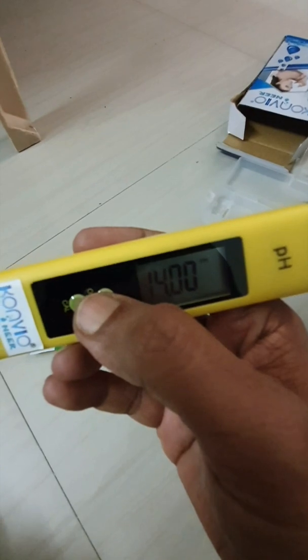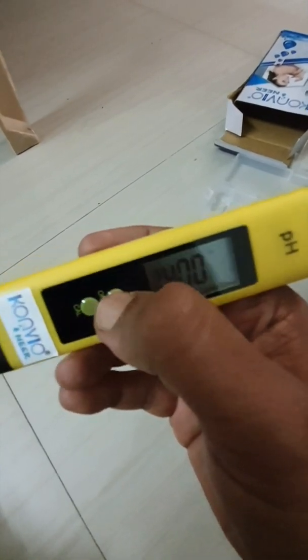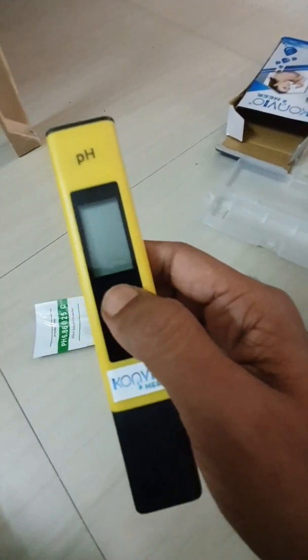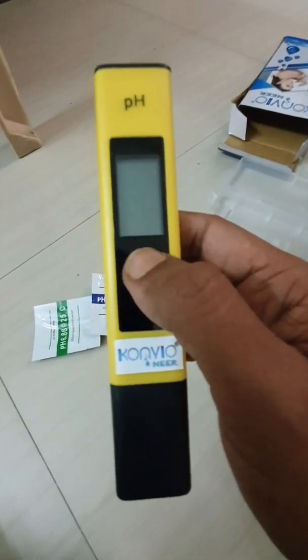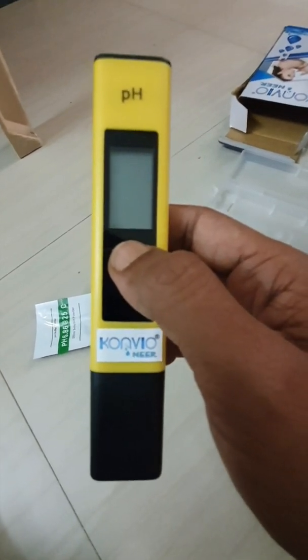As you can see, it's not calibrated — I'm not sure what it's showing. It's showing the max value of 14. So let's turn it off and wait for the calibration part, which will be uploaded tomorrow maybe.